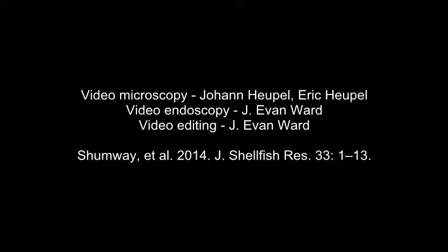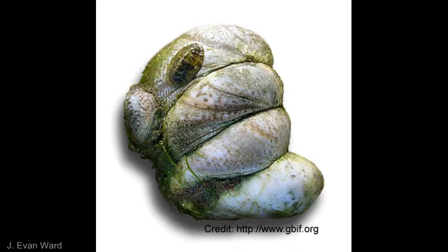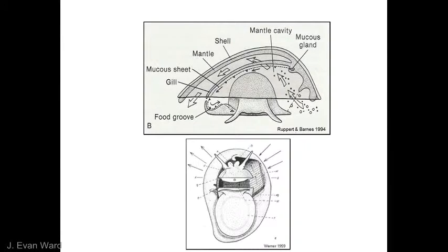This video describes the feeding processes of the Atlantic Slipper Snail, Crepidula fornicata, using both video microscopy and video endoscopy. Crepidula are suspension feeding snails that often form stacks of 2 to 12 individuals. They feed by capturing particles on their gill and transporting the material to the mouth for ingestion.